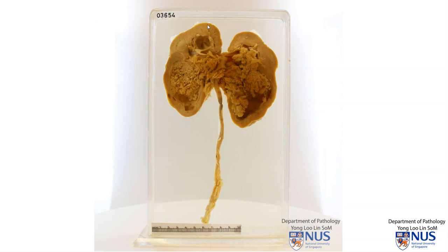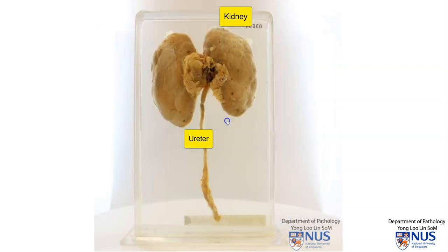Hello, this is a gross specimen of a kidney that has been bivalved, along with the proximal ureter. Looking at the capsular surface of the kidney, this is the hilar fat. Sometimes we may get some lymph nodes in this region, and again the proximal ureter.